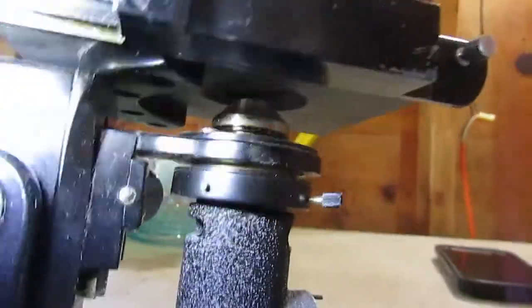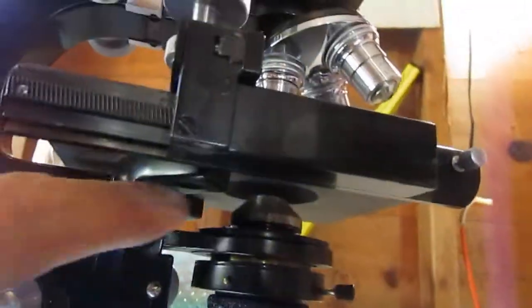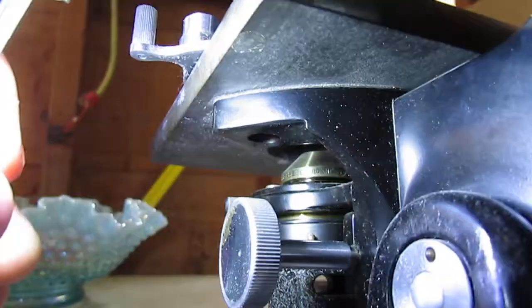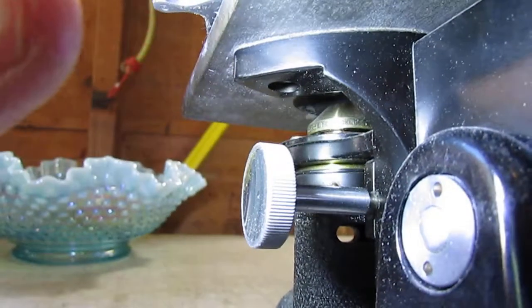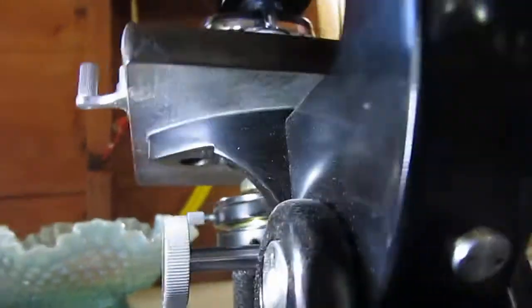We did notice that underneath, right here, that is marked a paraboloid condenser. Not really sure what that means or if that's of any benefit.